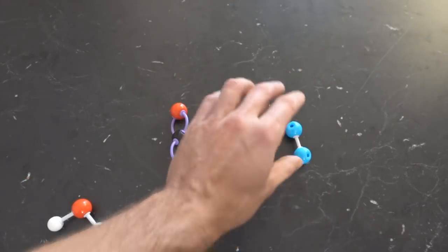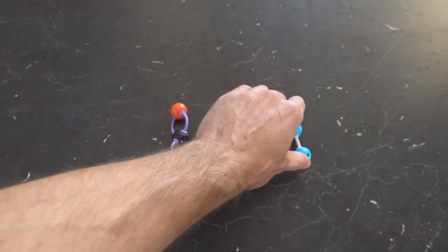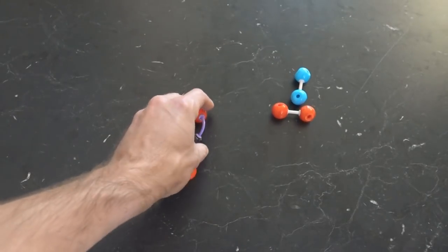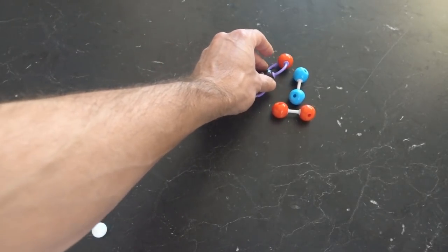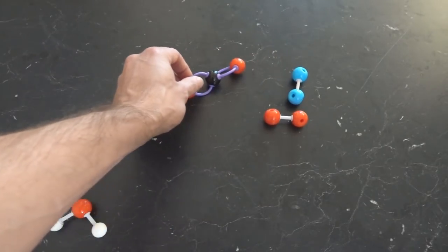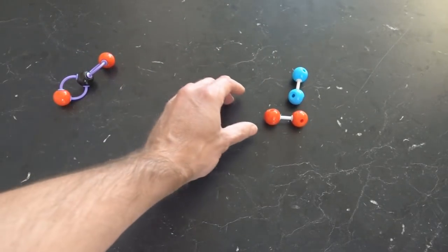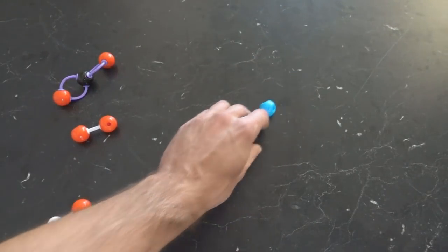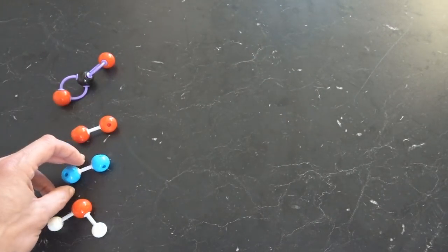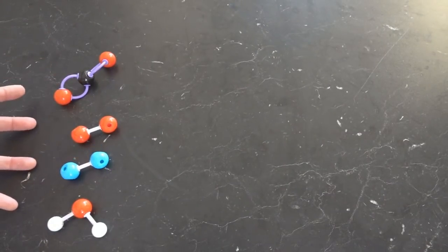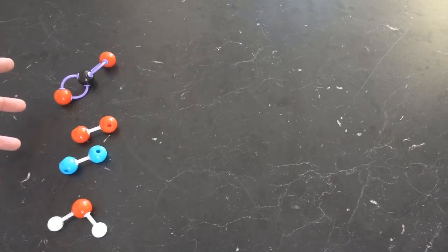Now, that machine there will very easily separate out these. So basically, we feed in the air that we breathe out. And the heavier molecules go more straight. The slightly less heavy ones come down here. The lighter ones come down here. That's basically how these things would separate out. So you can measure the components of what you're breathing out in real time very dynamically.